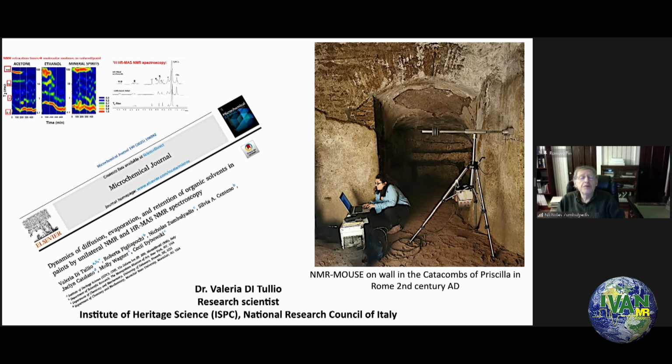One has to be very careful, of course, because the inverse Laplace transform is technically what's called an ill-posed problem, and I think we've tried to use the minimum number of components to explain the non-exponential CPMG curve that one obtains. There are three components that can be associated with the polymer matrix: the backbone, the chain ends, and possibly dangling chains on the side, and also a couple of motional regimes for the solvent, bound and free.